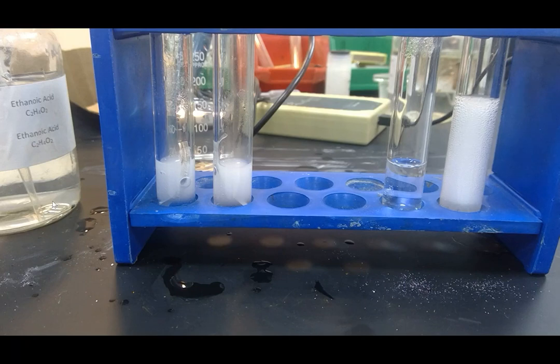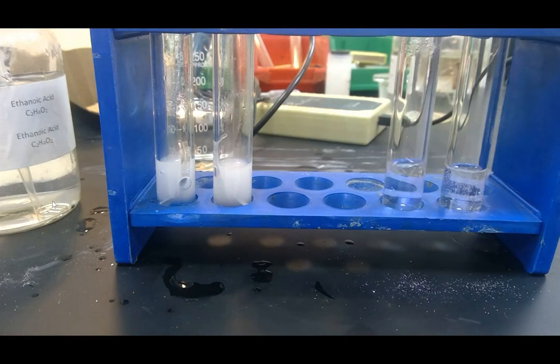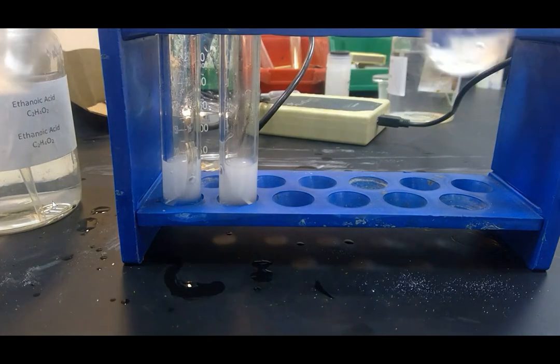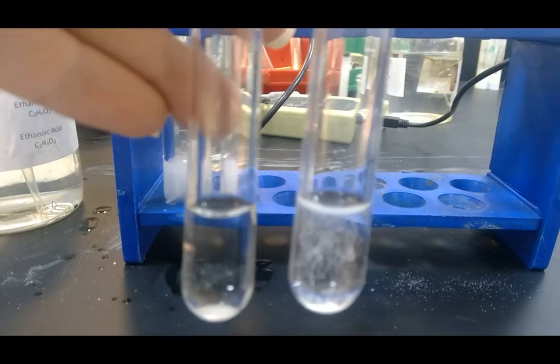Okay, so again, you can see that they both fizz when you add your sodium carbonate to them. We're looking again at the amount of solid that's left in both cases.